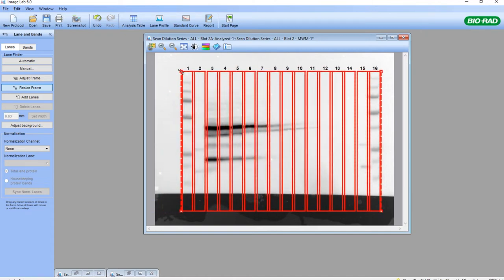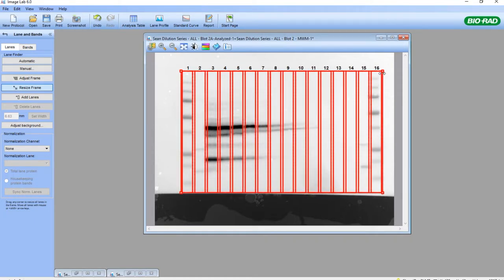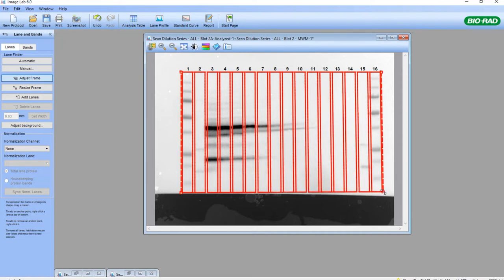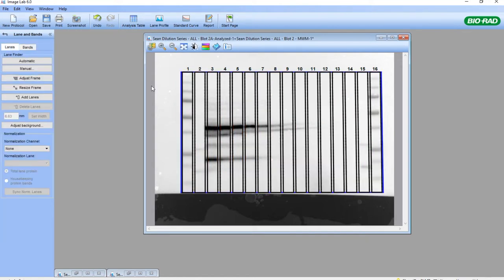I'm going to stretch the Lane Tool so it covers those markers, from the top. I can see there's a little bit of inaccuracy at the bottom, and if I need to adjust, I can click the Adjust Frame Tool to provide some fine tuning to assure that the bands are inside the lanes. If I want to adjust the width of each lane, I can click on the Band Tool and then back into the Lane Tool, and now I have a new tool to select the individual lanes.